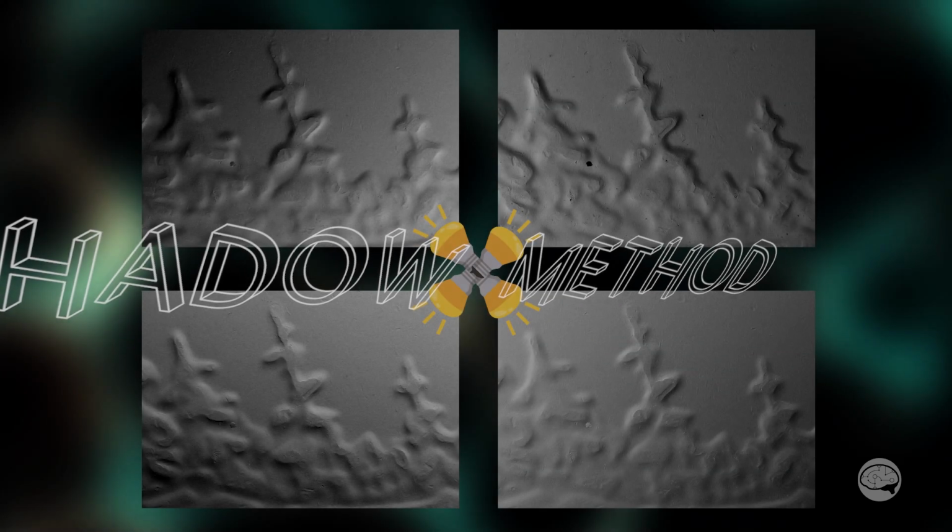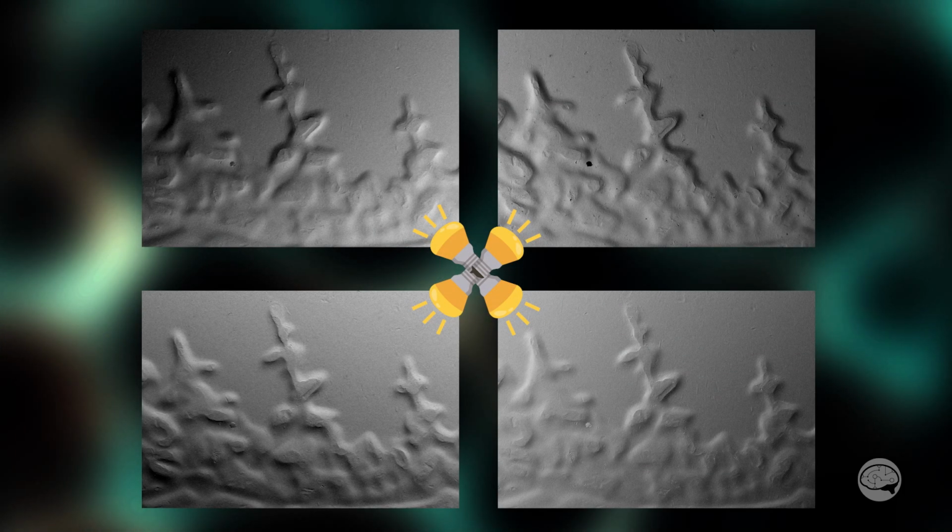Bottom line is that it's very easy to collect data, it's good with high aspect ratios, Z numbers are all very accurate because it's based on math. Unfortunately, it's really unusable on certain types of samples, and the resulting surfaces may require a lot of post-process massaging. The shadow method involves taking multiple directional images in the SEM, usually with a segmented backscatter detector, and using the shadows to calculate and reconstruct the actual surface of the sample.